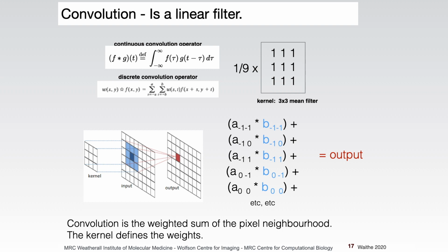So this is it again. We take our kernel, the positions of our kernel, and the image, and we multiply them in each position, then we sum them up, and we put them as an output. And then we do this for each position in the image.